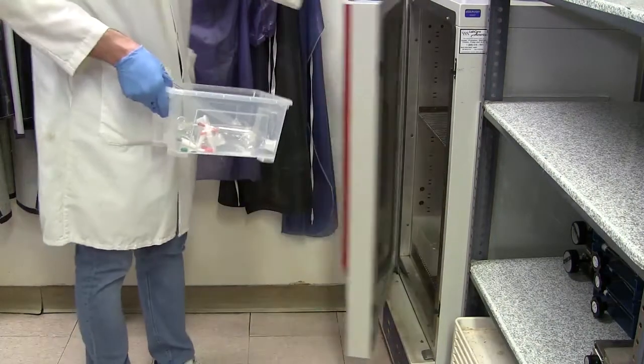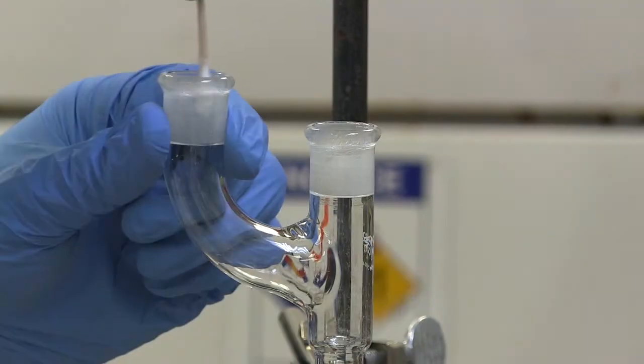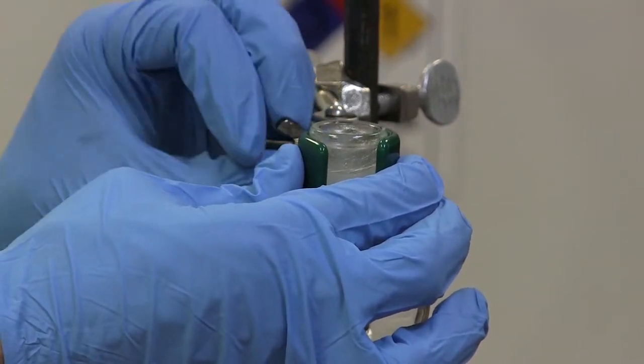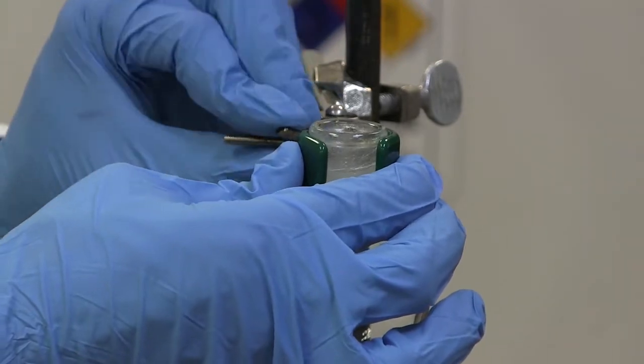Begin by grabbing glassware from the oven. Make sure your glass joints are properly greased, otherwise they will freeze. Obtain a round bottom flask and secure it with clamps on a ring stand. Make sure the clamps are high enough to allow space for a jack and heating element underneath. This will allow for easy removal of the heat source if needed.